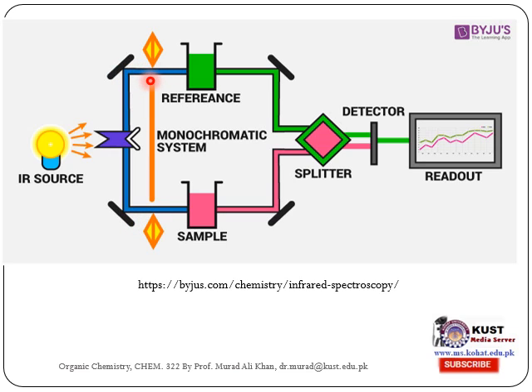Then one passes through the reference and the other through the sample. It is again reflected by mirrors and then passes through the splitter and then through the detector, and the detector detects the radiations, and then we get a spectrum from the spectrometer or spectrograph.